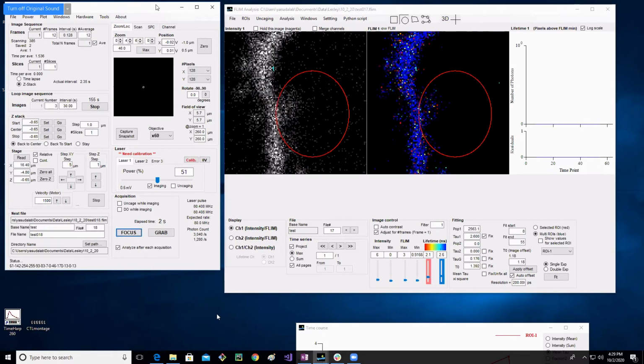Okay, so there are a lot of other things that this can do. You can basically image a certain region by changing the angle of the mirrors instead of the region that it's scanning, but you guys don't need to worry about that. Here, one nice thing is it shows you the size of your field of view.